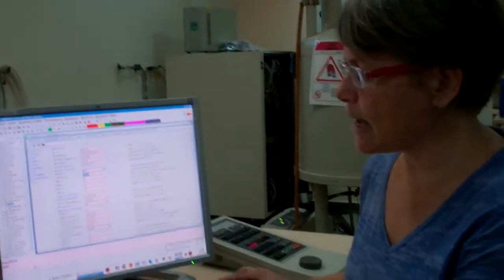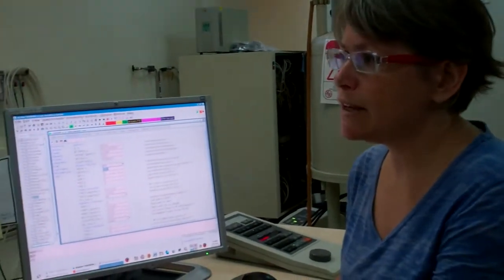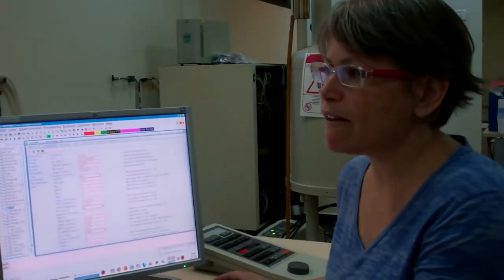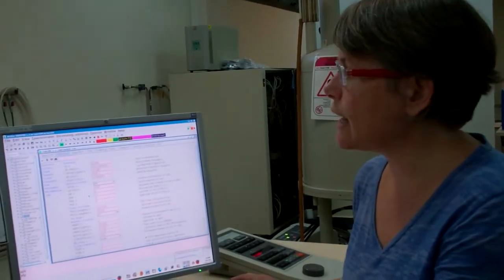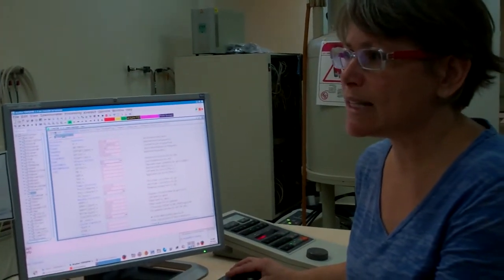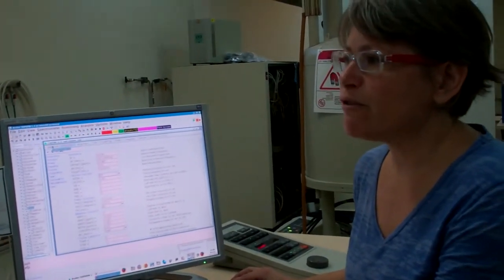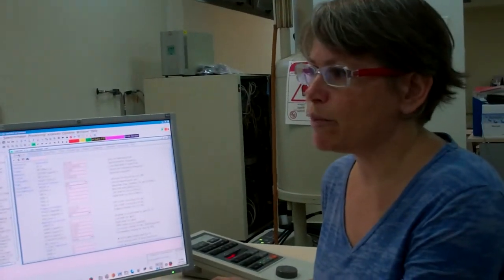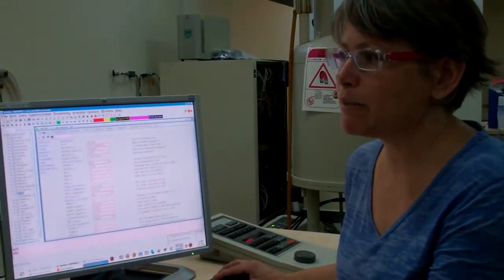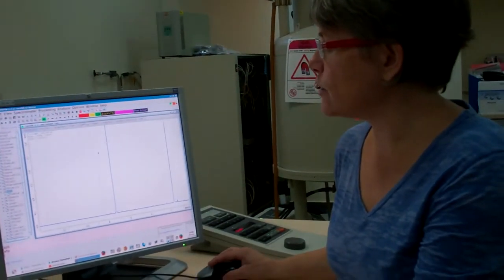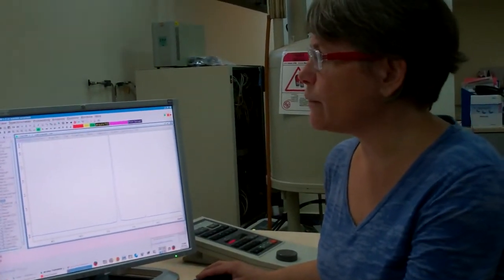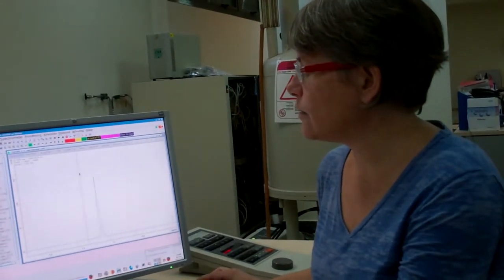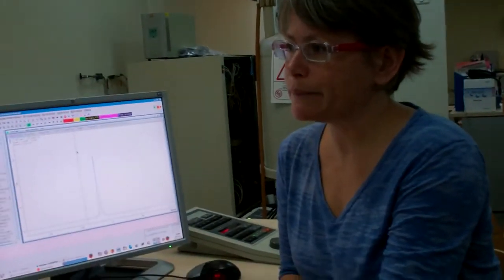I'll type EFP, enter, and the computer will first multiply the FID by the exponent, that's the E, and then Fourier transform, that's the F, and then use the phasing that's stored in the PHC0 and PHC1 values, that's the P. EFP, enter, and here's our spectrum with some sensitivity enhancement for smoother peaks.